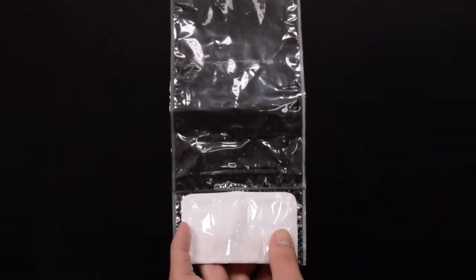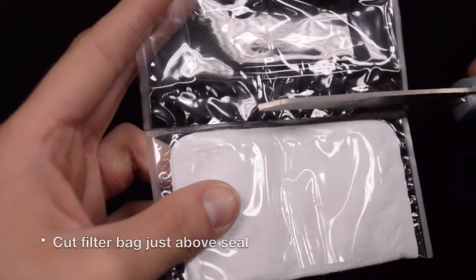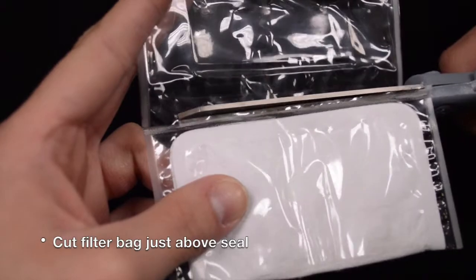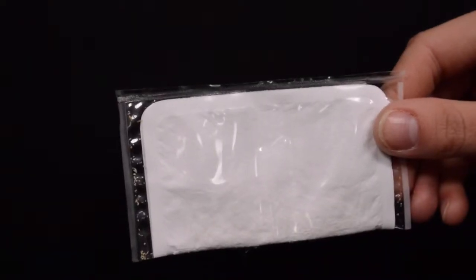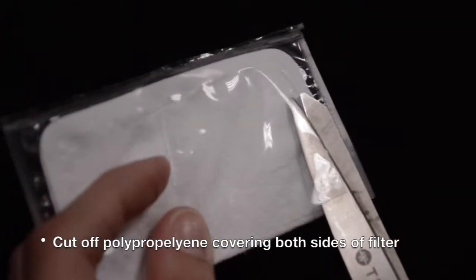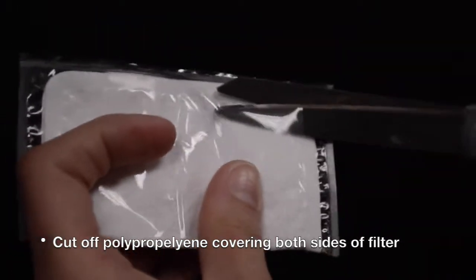It is important to remove as much of the polypropylene as possible. This minimizes the acid needed during the Kjeldahl procedure. In order to remove the majority of the polypropylene, cut the filter bag just above the seal which you made prior to drying the bags. Cut off both sides of the polypropylene that cover the filter, being careful not to cut into the filter.